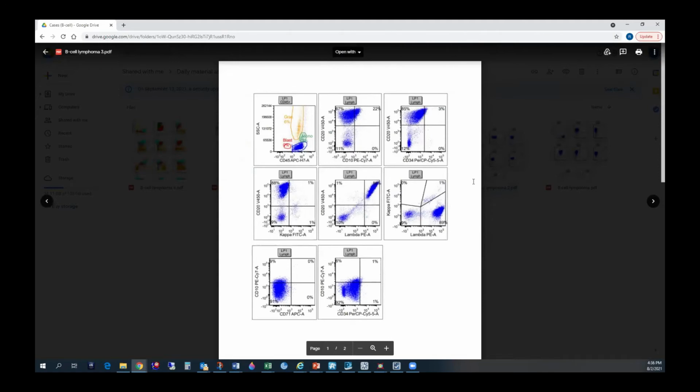Okay. To my knowledge, if there is a suspicion for CLL, it's important to do a T cell panel because at least 10 to 15% of the cases have coexisting AITL. So it's important to do a T cell panel along with CLL. I don't know if it is 10 to 15%. That is new to me too. Never seen that.